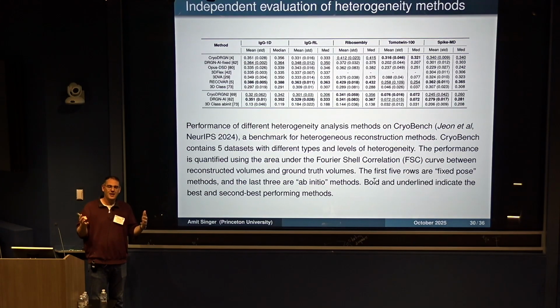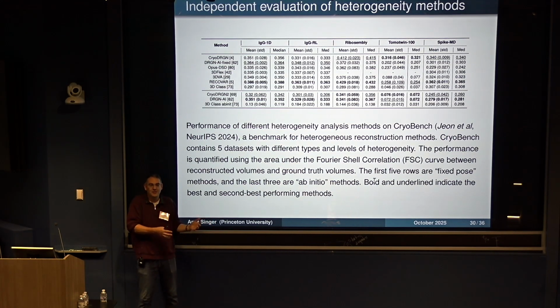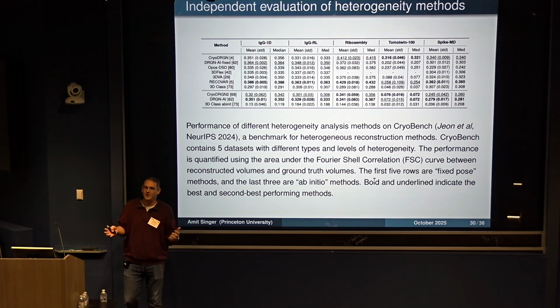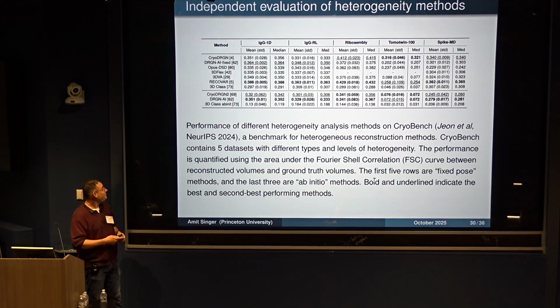And then my answer to Ellen is that we actually understand all the steps that we're doing, and we can even give guarantees for everyone. It's actually CryoDragon and the deep neural net that we don't really understand. The fact that there are so many successes of neural nets in other fields and you now expect it to work so well in this application doesn't mean that it should, and it should outperform everything else. And it's not only in terms of the resolution.